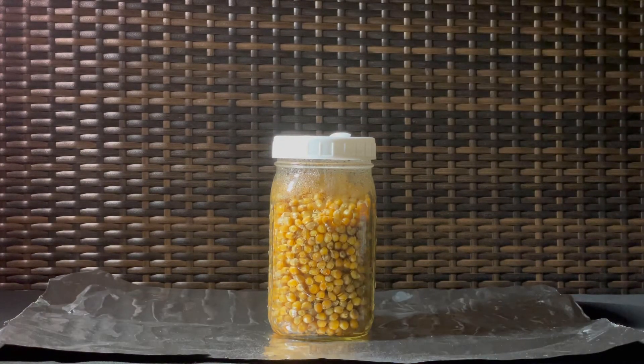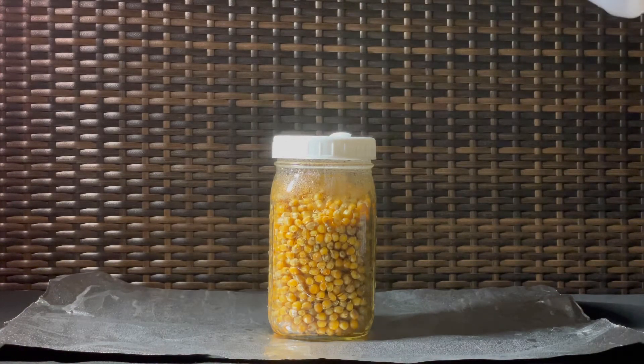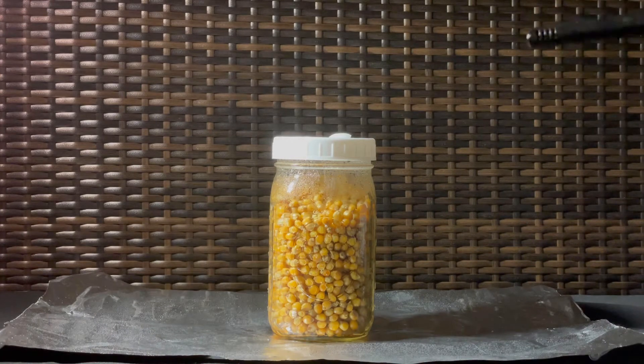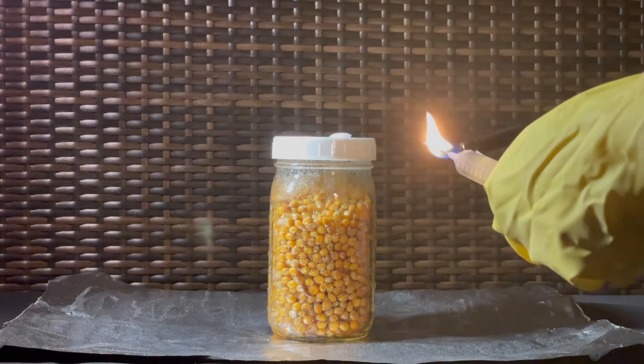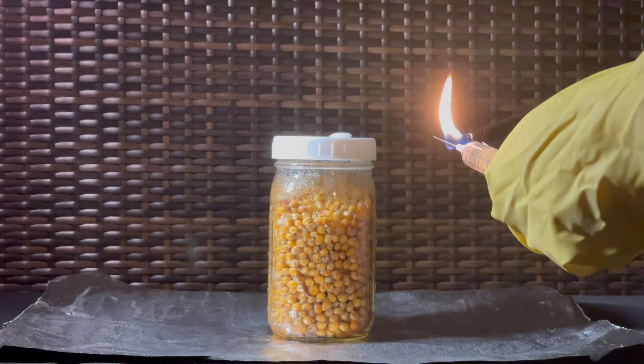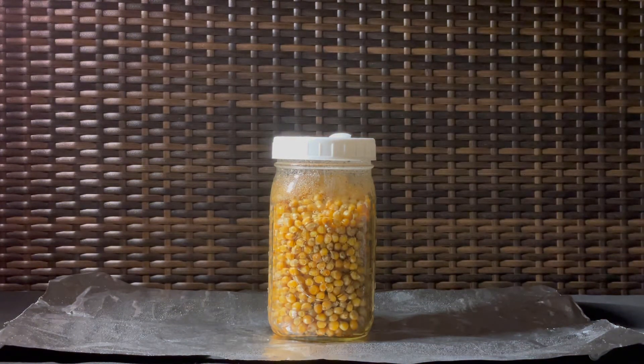Spray the jar you're about to inoculate with alcohol. You should repeat these steps for each and every single jar. Once you're ready, flame sterilize the tip of your spore syringe and then spray it down with alcohol.